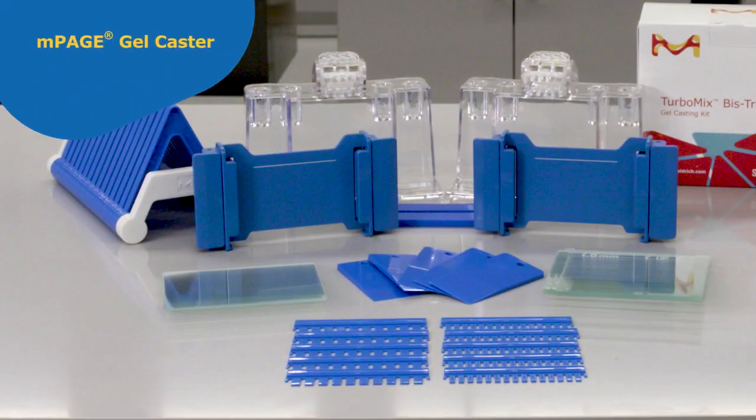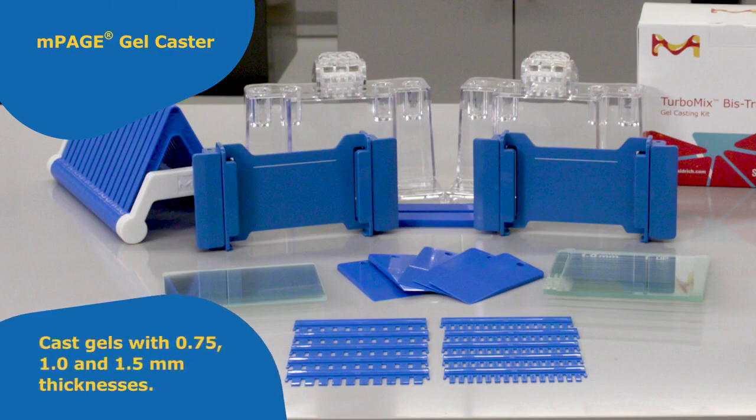The mPage Gelcaster is used for the hand casting of gels with a 0.75, 1.0, or 1.5 millimeter thickness.